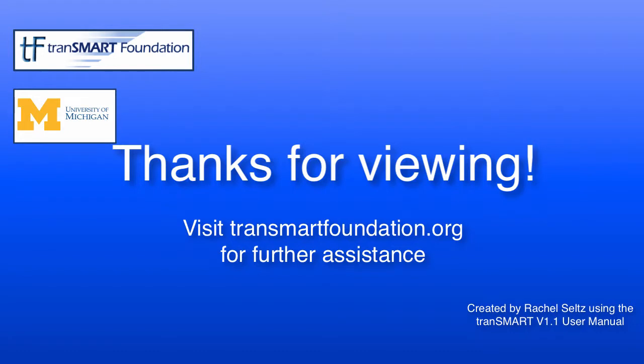You have now seen all of the heat maps that tranSMART allows users to generate. For more assistance with heat maps, see the user manual at tranSMARTfoundation.org.